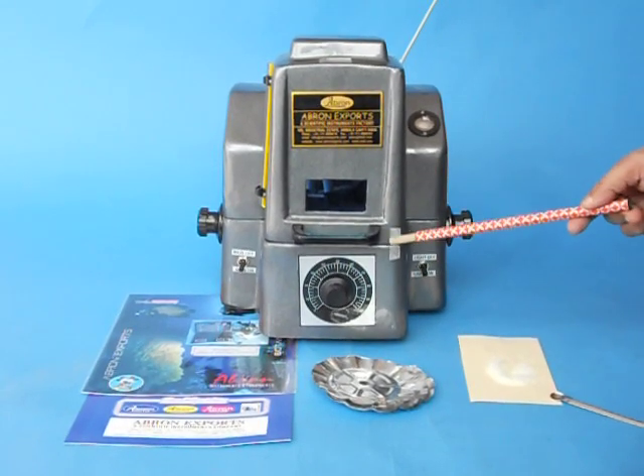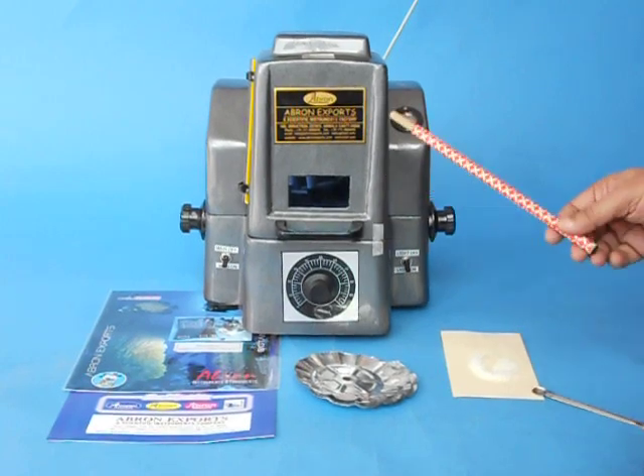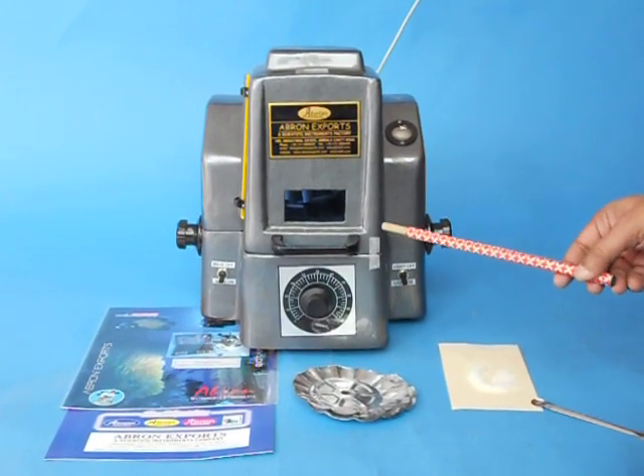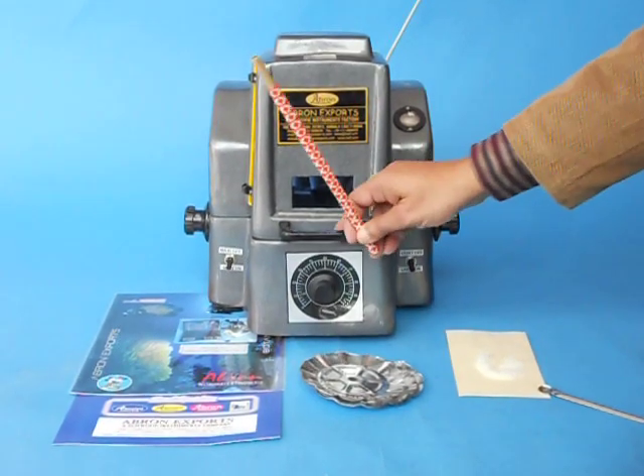This is the Moisture Balance by Abron Exports, an Infrared Moisture Balance. It is used for measuring the percentage of moisture in any powder which may be available.